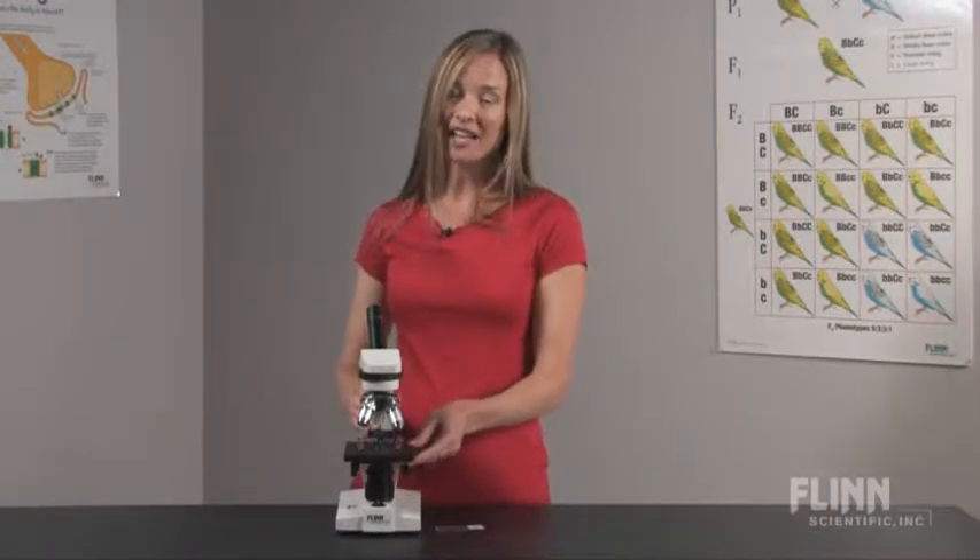The Flynn Middle School Compound Microscope might say it's for middle school, but it's not a toy. With quality optics and a sturdy metal body, this is a great microscope at a great price.